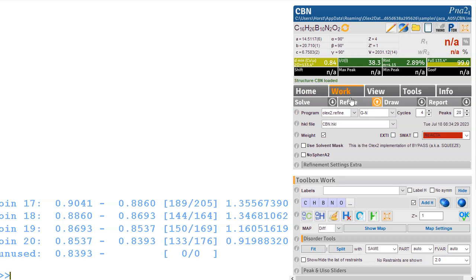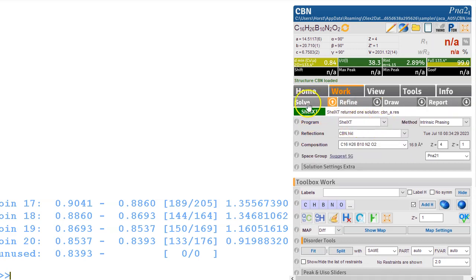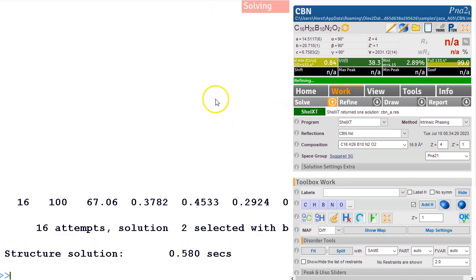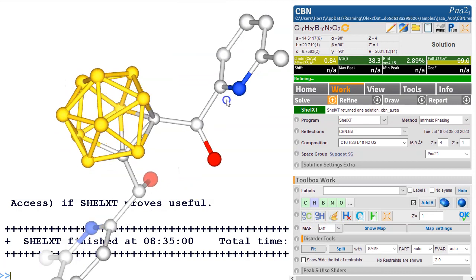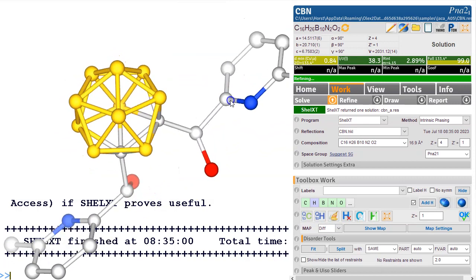Let's go and solve the structure. Structure solution, settings here ShelXT will do just fine and solve it. And we should have the structure on the screen in a second. Here we are. Okay, here we go.